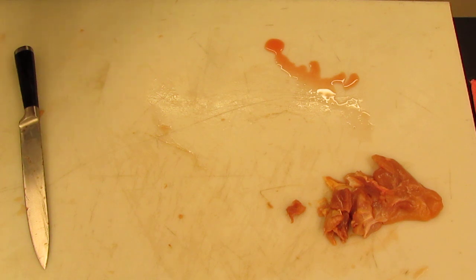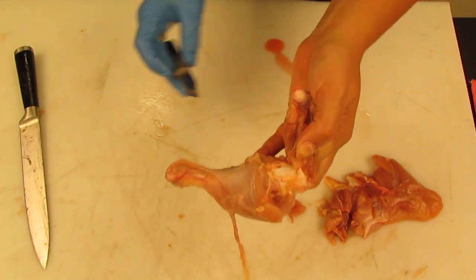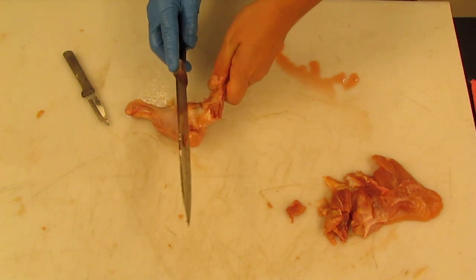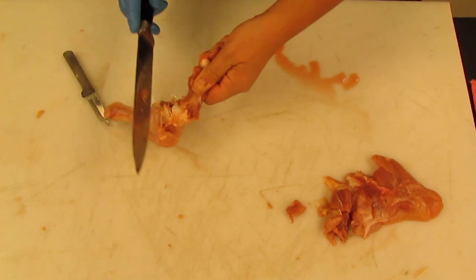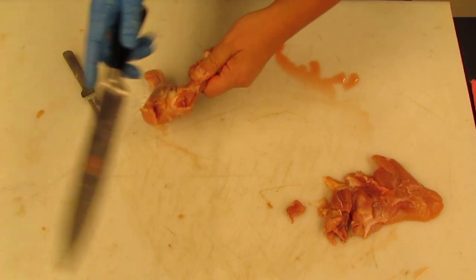Okay, so I'm going to do right here. And up there. There you go. That is a collateral ligament. All right, now that we've appreciated that, I'm going to cut through it. All right, nice and gentle. I don't want to cut all the way through and completely separate the two bones just yet.